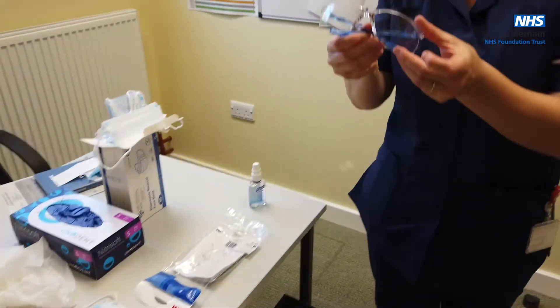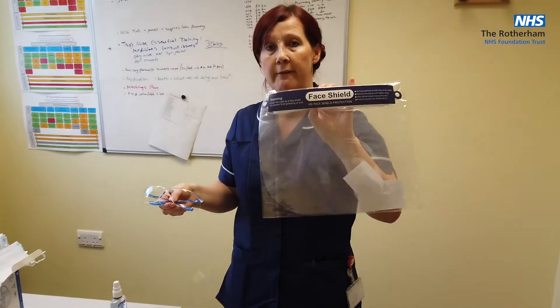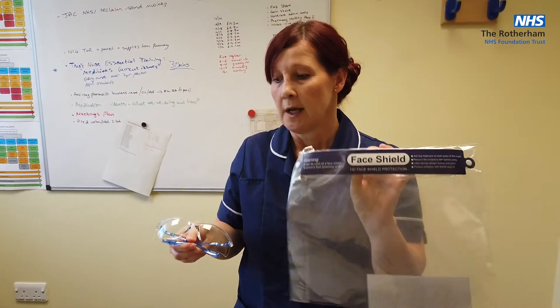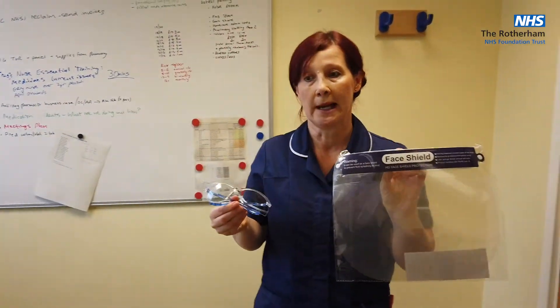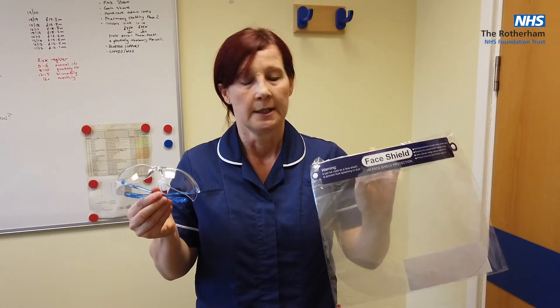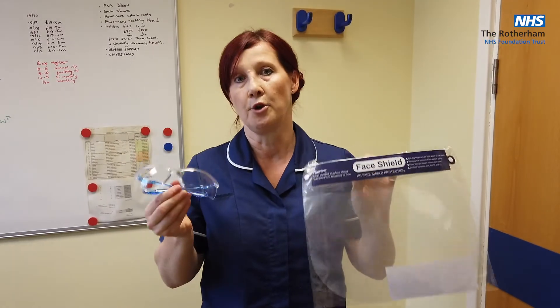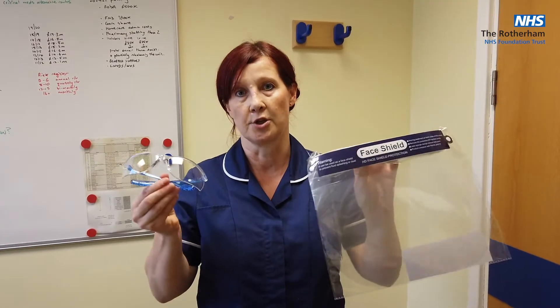Eye protection can either be goggles or a visor, whichever you find comfortable and whichever is provided to your area through stores. Once you've got those in place — whichever one you choose — they can also remain in place as sessional use if comfortable.